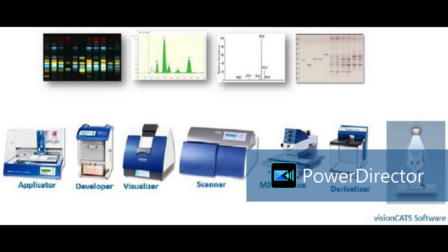Then this is fatal suicidal poisoning by chloroquine in the presence of alcohol. So in visceral samples, this type of separation is sometimes obtained. Observe, this is an old paper, old literature, but after separation you will get these two bands having UV absorption properties. So we can take the absorption spectra of this and match the spectra with the library and find out it is because of chloroquine. It will show you the matching with the chloroquine absorption spectra already stored in the library.